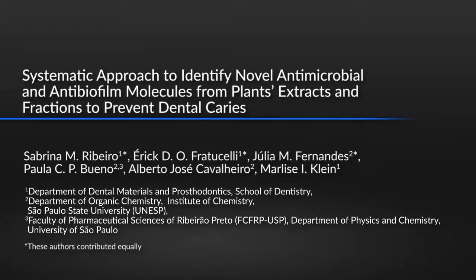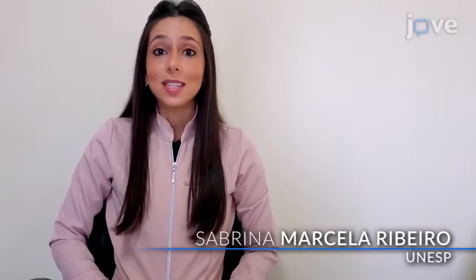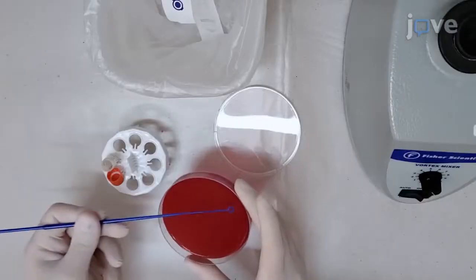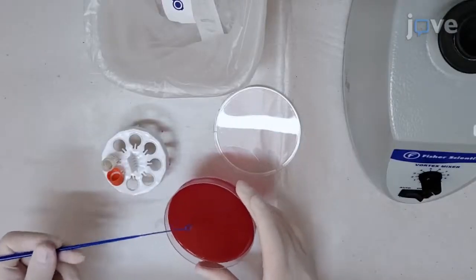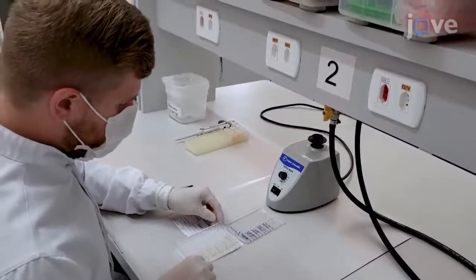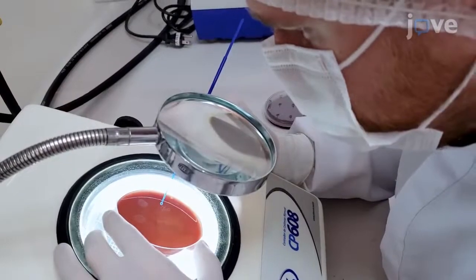The presented protocol is useful for rapidly screening and analyzing bioactive candidates in natural products to control oral biofilms. It can also be adapted for applications in other biofilm research fields. This multi-target screening and analysis method makes it possible to screen multiple active components simultaneously.